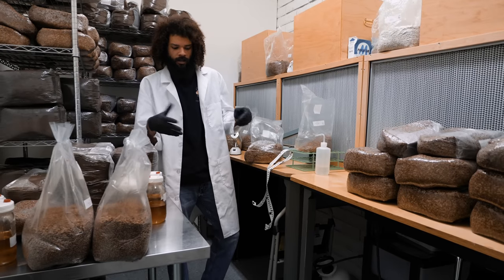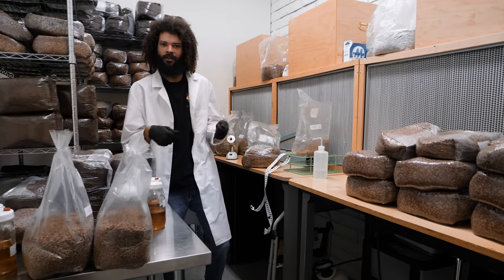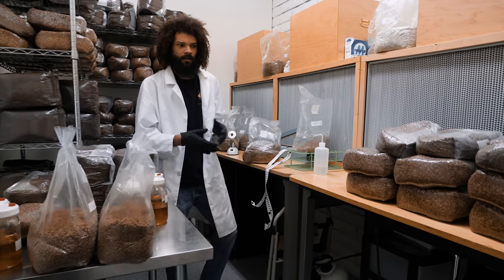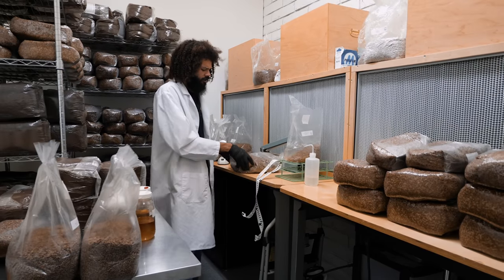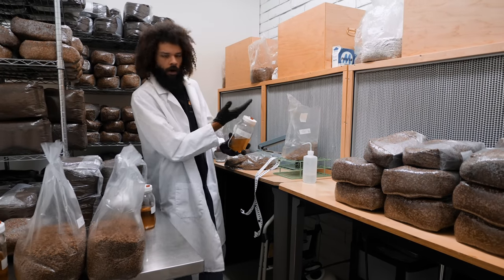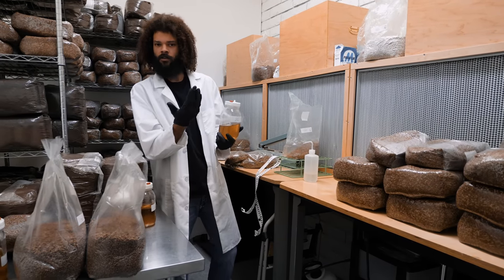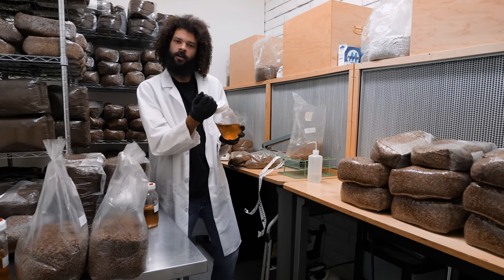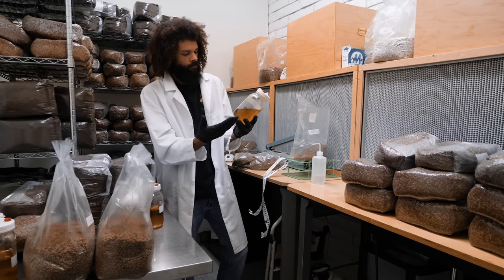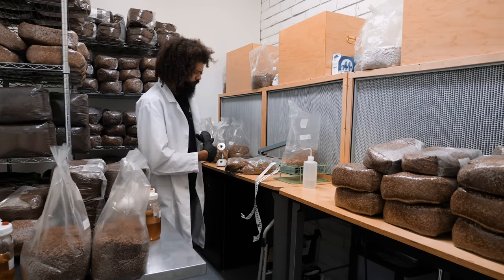I covered it with one of those zip-up plastic comforter bags and was able to do my transfers in there — that was our first rough glove box, and it worked fine. All inoculations were done into jars, so I really didn't need the flow hood. Everything was done with a syringe — I could flame-sterilize my syringe until the needle was red hot, then inoculate the jar. I would get really good results that way, and it was very successful.